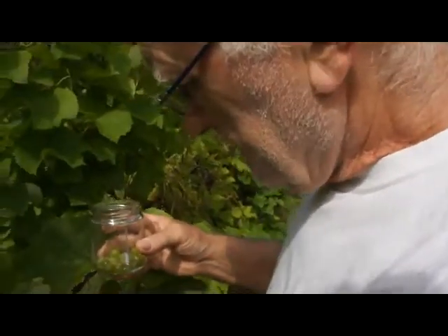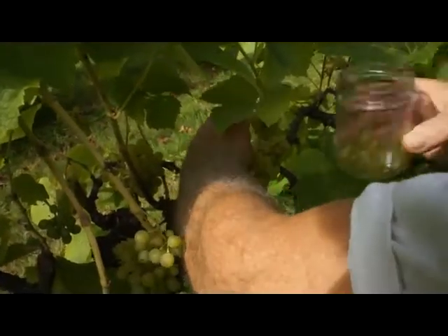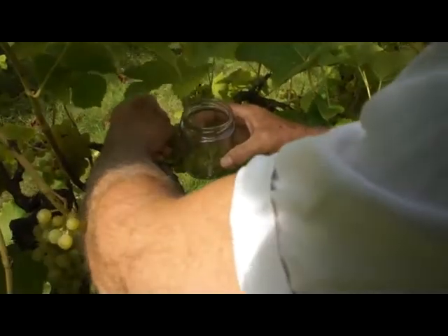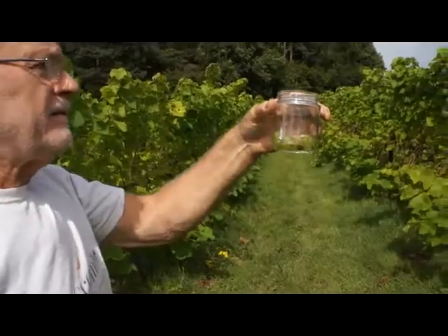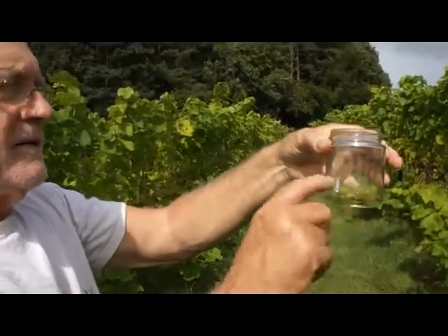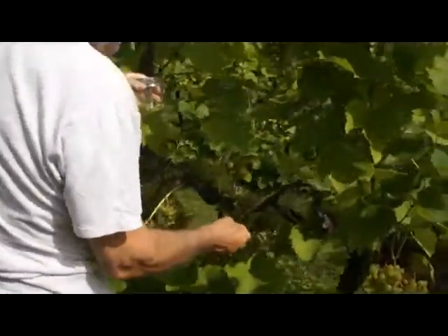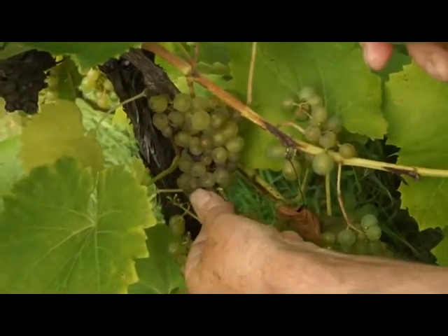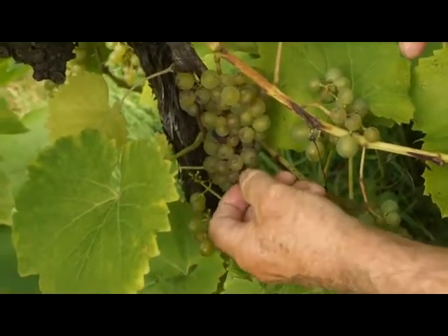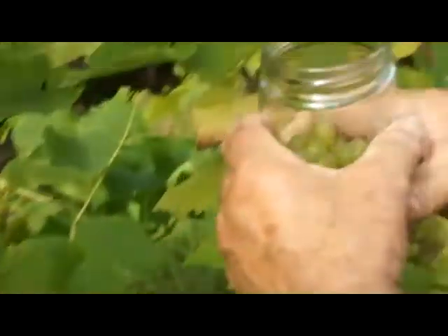Let's take some from up here — the back of this bunch here. Just hold it so I don't pull the whole bunch off. There we are, they're going in — two, three, four rows and we've got about that much. We've got to get up to about here, so we're okay. Take a few more from here. There's some with different sizes — three big ones, a couple of little ones. Pop them in.